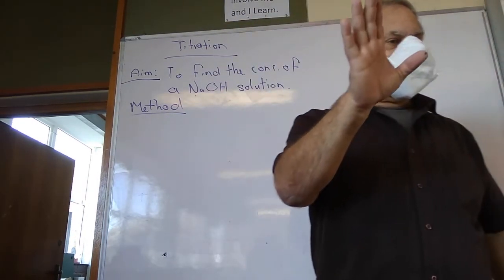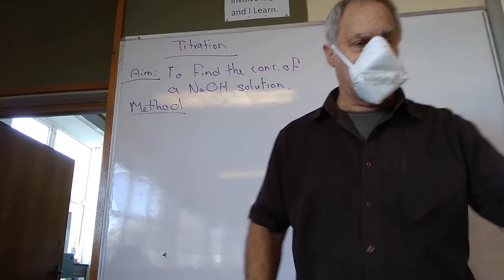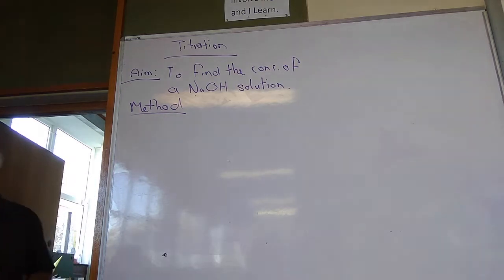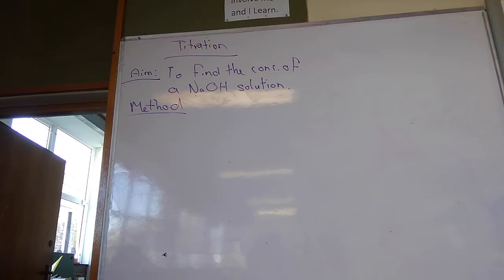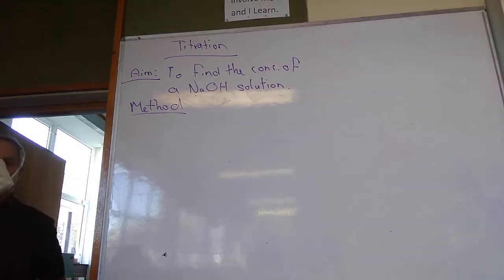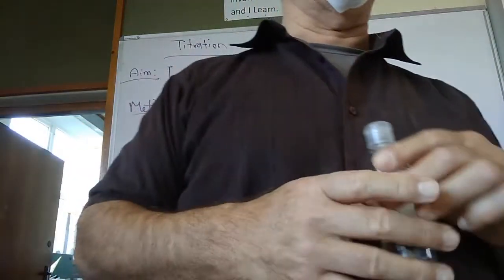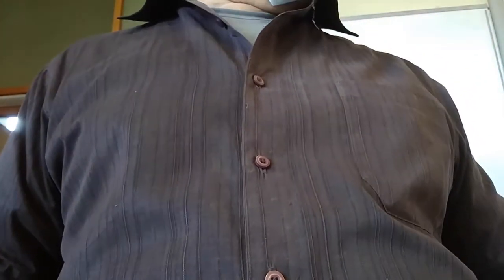Okay, so the first thing we're going to need is a sodium hydroxide unknown solution. I'm going to ask all people to participate. So I need someone to come and make a sodium hydroxide solution. It's the easiest part of this experiment. Who wants to do it? But you must clean your hands before and clean your hands afterwards. Okay, who wants to come and make a sodium hydroxide?